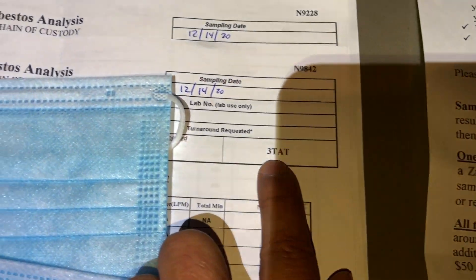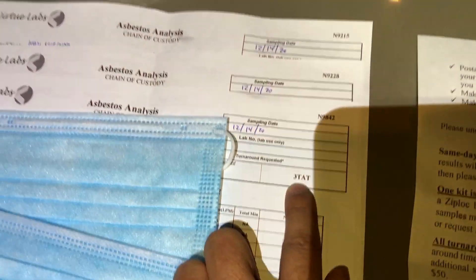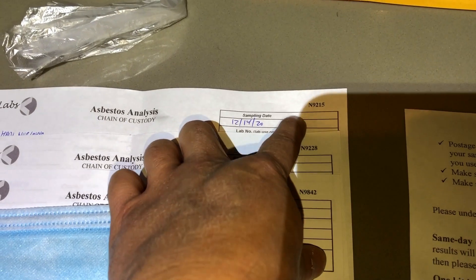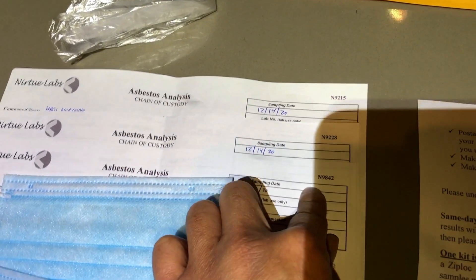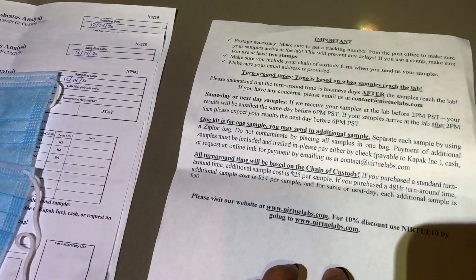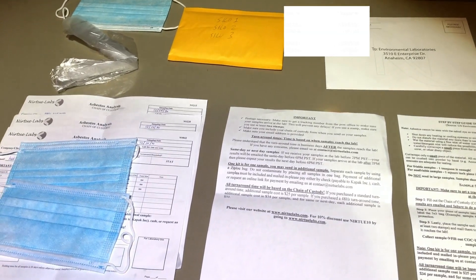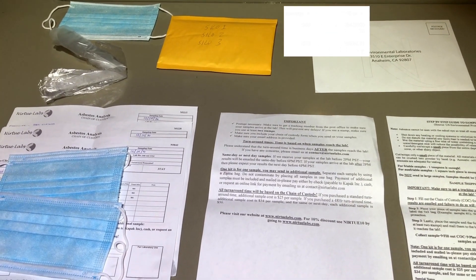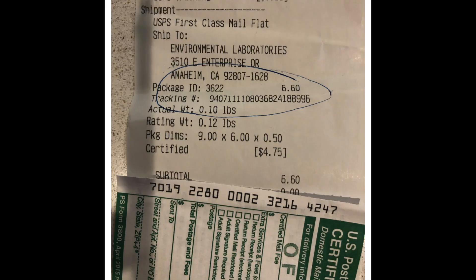The most important thing in the instructions is the sample size. Friable material just needs one teaspoon; non-friable should be no more than one square inch. Once you put everything in the envelope it takes about three days — that's the service level I paid for. Each chain of custody paper has a serial number so they know the forms can't be faked.